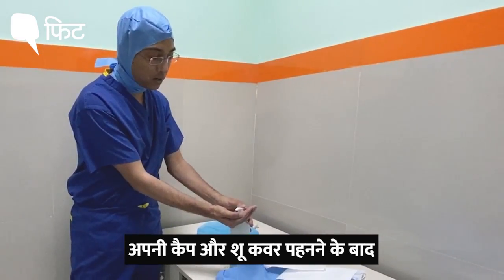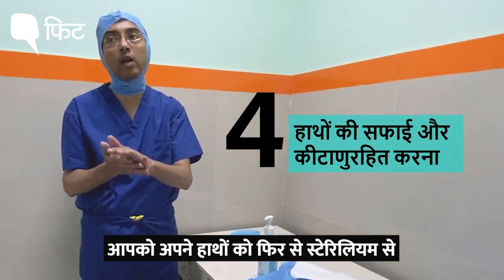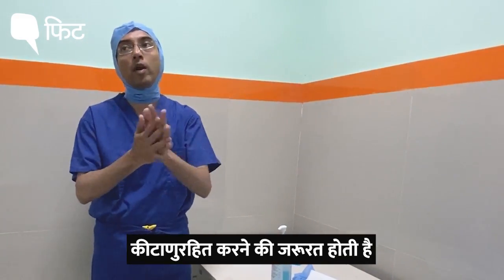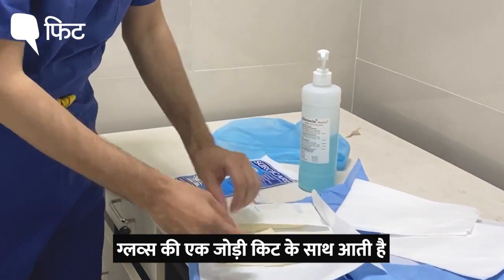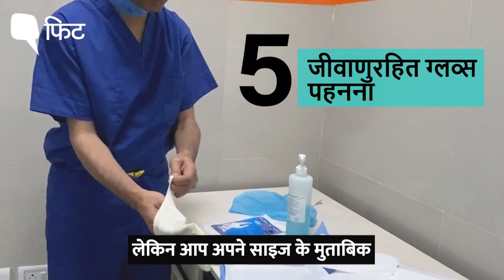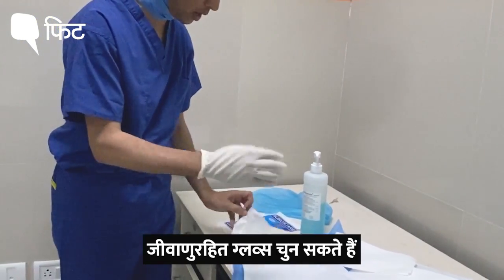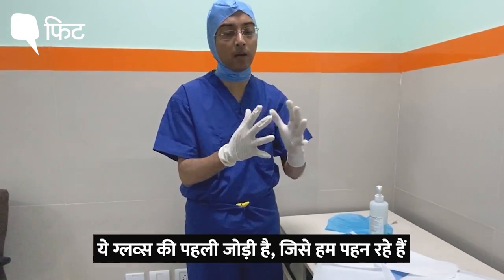Once you have done your cap and shoe covers, you are again going to take sterilium and do 30 seconds of hand sanitization. There is one pair of gloves which comes here, but you can choose your size. This is the first pair of gloves that we are going to wear.